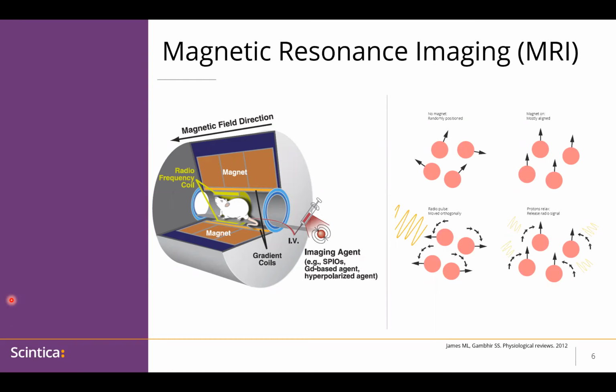So in an MRI system, there are three main components. There's the magnet on the outside, and that's going to create your static magnetic field. The gradients sit inside of that. And these are actually what helps us to localize the MRI signal in three-dimensional space. So this is where we start to differentiate between NMR and MRI, and we actually can create an image using this. And then we have the RF coils, and those sit around the imaging subject. And those are what both transmit and receive signals typically and are interpreted into images.